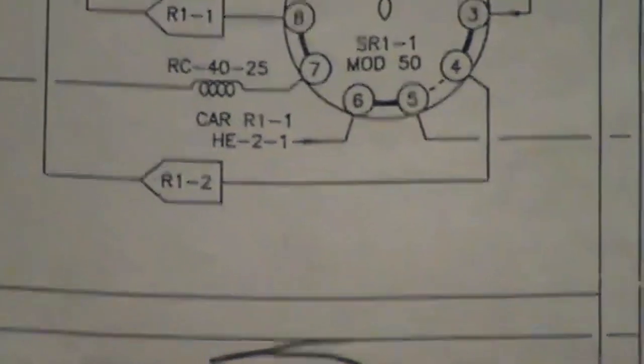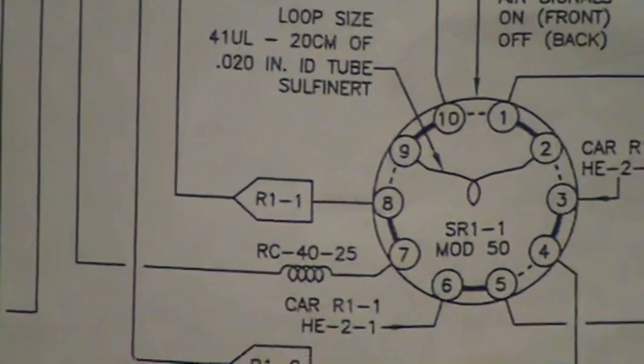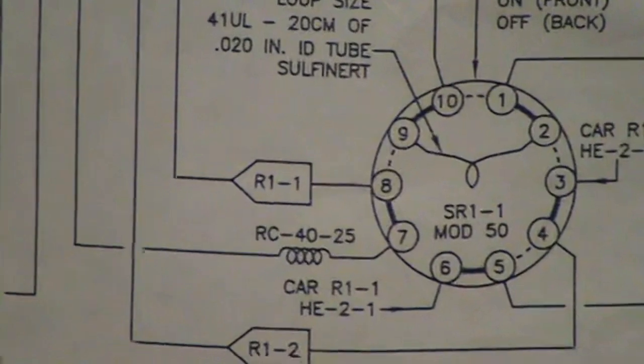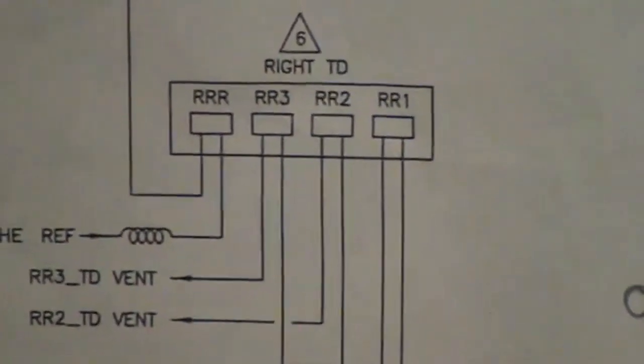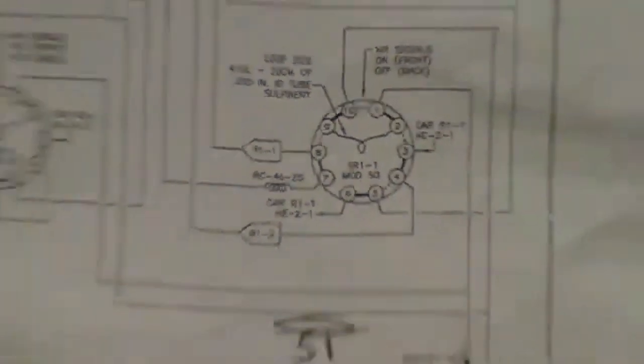Anybody that we're not wanting to be measured like this, we will back flush when we turn the valve off, and they will come back through column number 1, go to 8 to 7 through that curly Q, which is a restrictor, and then go to detector number 3, which is the back flush.